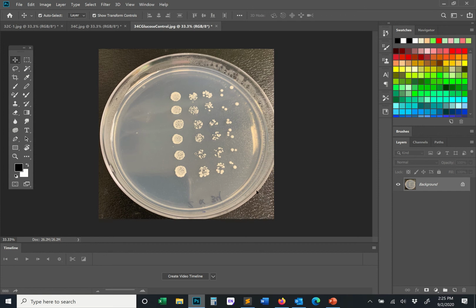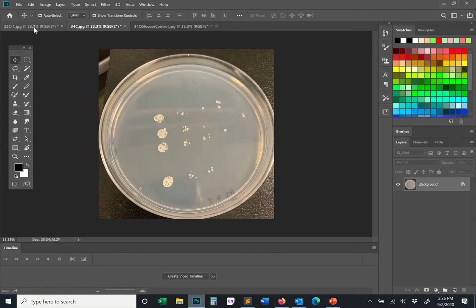So if you're in a scenario where you're taking actual images of data, one of the biggest problems can come from you acquiring those images and the quality at which you're acquiring the images. When you're taking pictures, you need to take the picture and look at the image and ask, is there anything wrong with this image that I've just collected? If somebody was doing this properly, they would note this image is actually pretty bad because there's glare, there's this background issue, and here's the cell phone, you can see the cell phone reflected back in these images. So again, these images are not good quality.